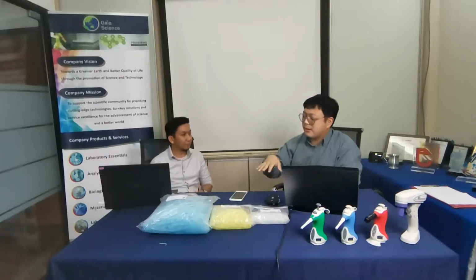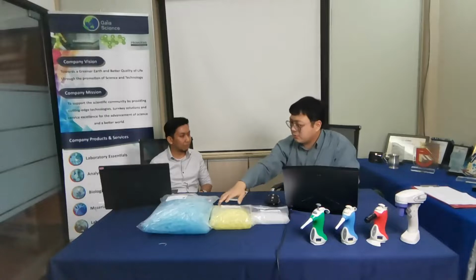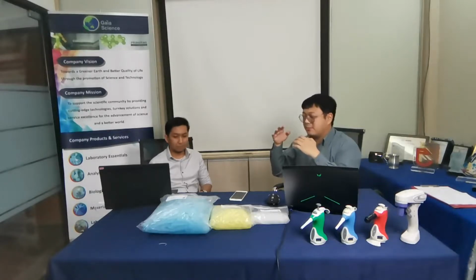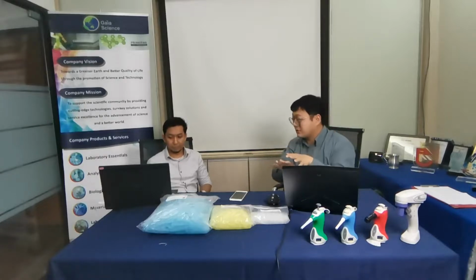Again, it depends on your pipette. If your pipette can take more than usual, or the highest amount is abnormally higher, test it out first, but it's at your own risk.